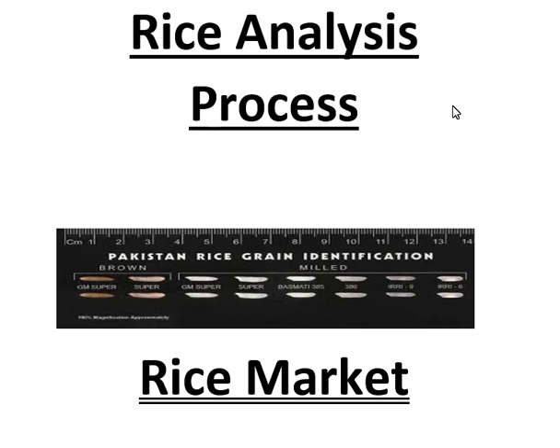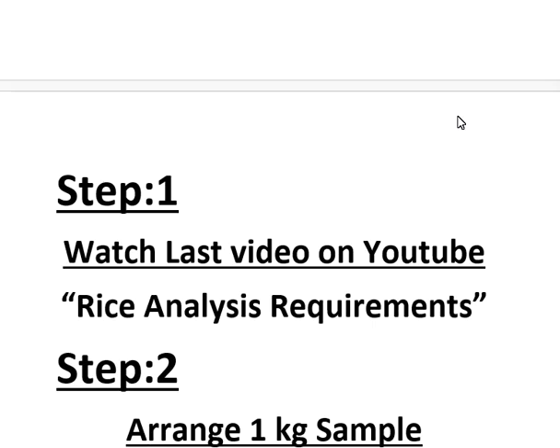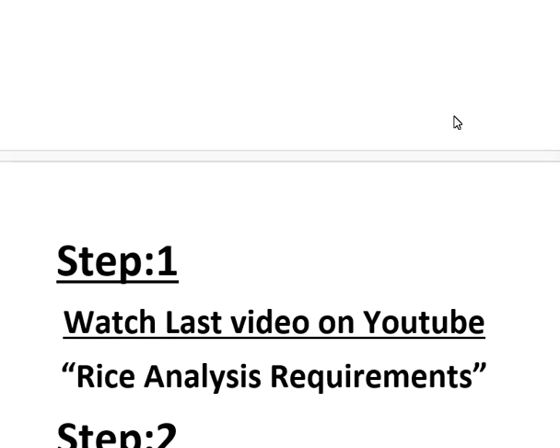Let's go towards the process. The first step is a pre-requisite video on rice analysis requirements — you have to watch that video first. In that video I basically explain the apparatus that is necessary for this process of analysis.